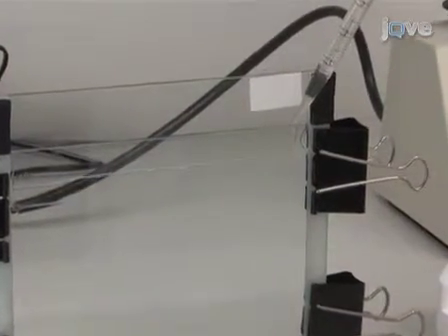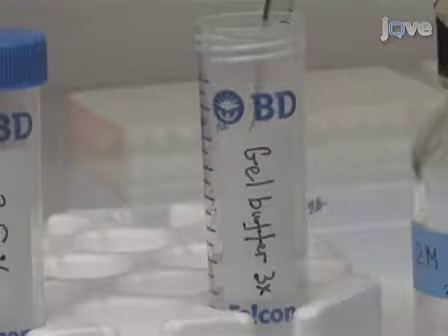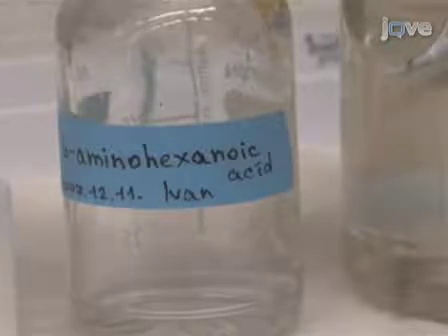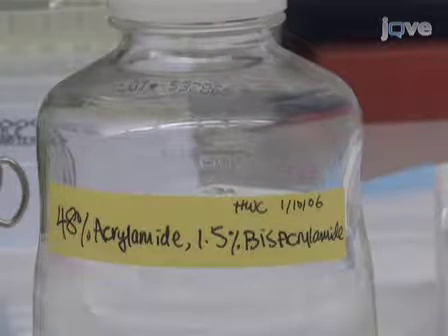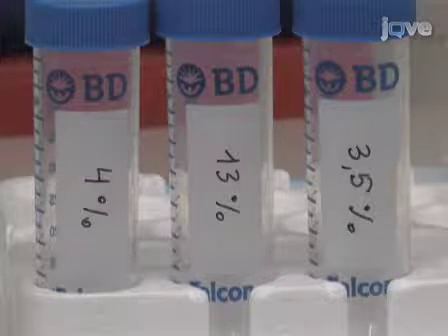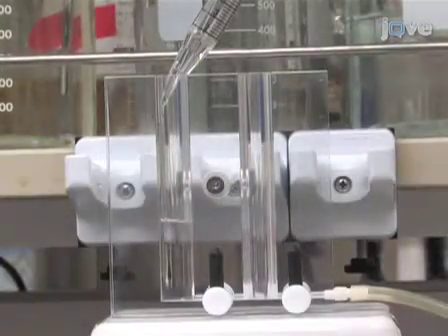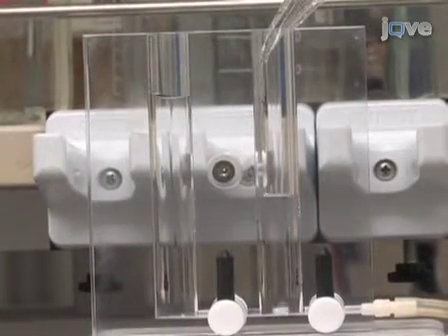Acrylamide and bisacrylamide are toxic chemicals, both as a powder and in liquid form, so special attention should be paid when working with them. We combine the acrylamide bisacrylamide solution with an aliquot of 3X gel buffer composed of 1.5 molar 6-amino hexanoic acid and 75 millimolar imidazole at pH 7.0. To make the gradient gel, we will make one 5% mix and one 13% mix, and the stacking gel will be a 3.5% mix. Do not forget to add glycerol to the 13% mix. When all three mixtures are ready, we add ammonium persulfate and TEMED and pour the mixtures into a gradient-former casting chamber. The left part contains the 5% mix, and the right part contains the 13% mix with a small magnetic stirring bar.